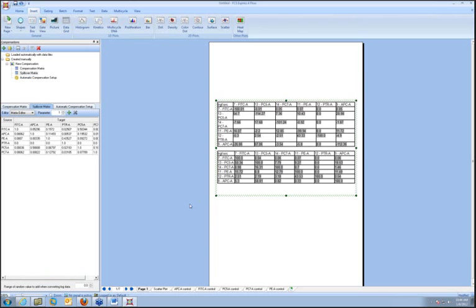If you want to export any of these to Excel, you can simply select one of these in the text box, copy it to the clipboard, and paste it. Of course, you can use our tokens and our batch processing to export the individual matrix elements as part of a batch. So if you want to batch through different sets of single stain controls over time, or you can simply just copy and paste, whatever works.